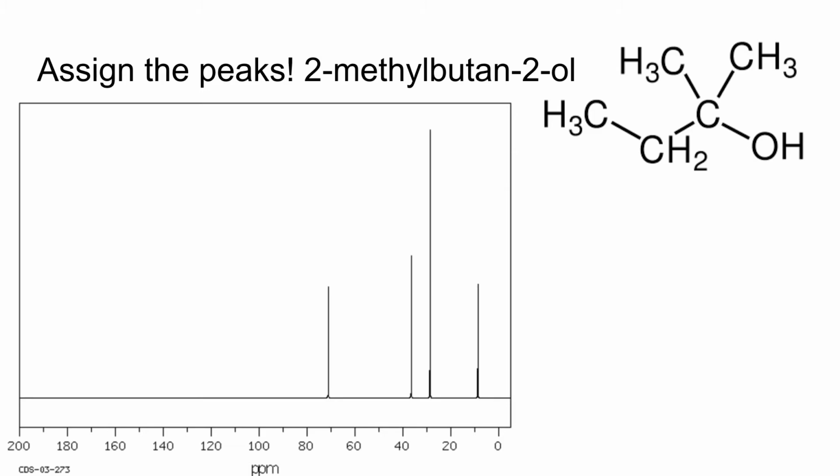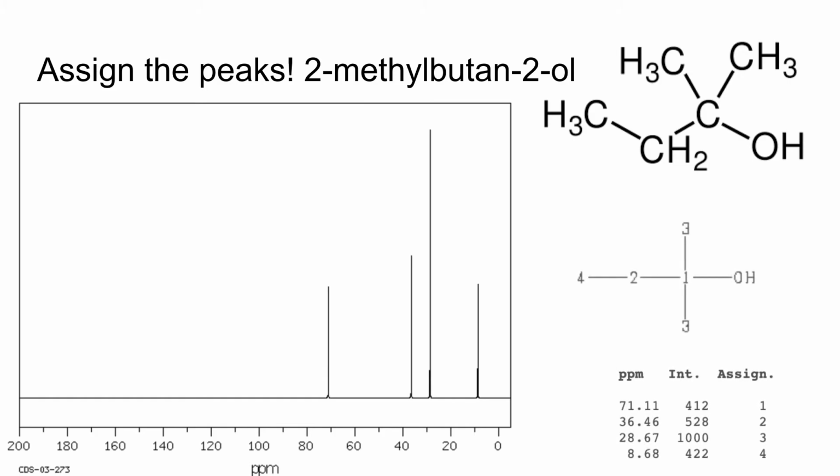What I mean is that if you had a compound with five carbon environments, and you had one carbon in each environment, all the peaks wouldn't be at the same height, just at slightly different random heights. But that's an example where you have one carbon per environment. Here you distinctly have different numbers of carbons in different environments, so you do have drastically different heights as well. It's not just randomness, it's due to the fact that you have carbons in the same environment.